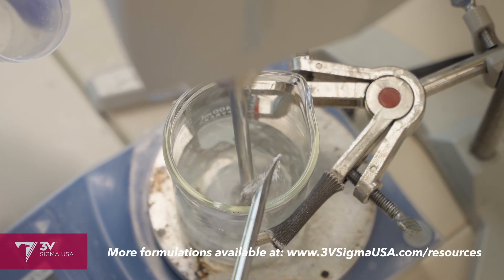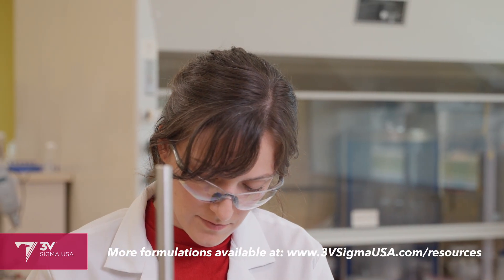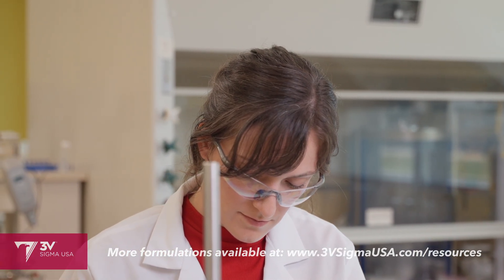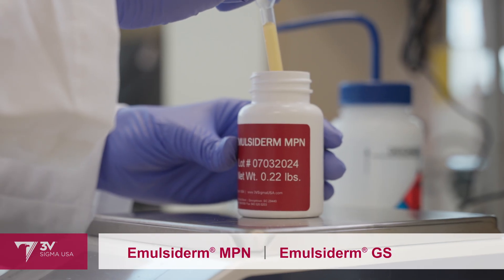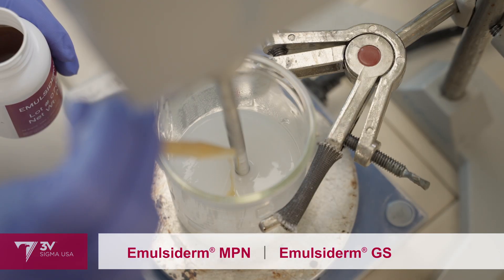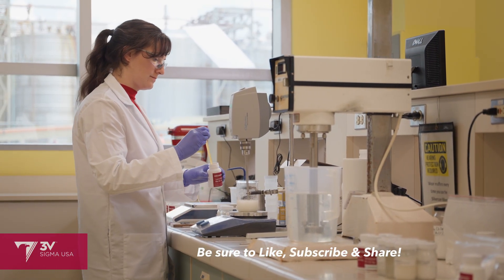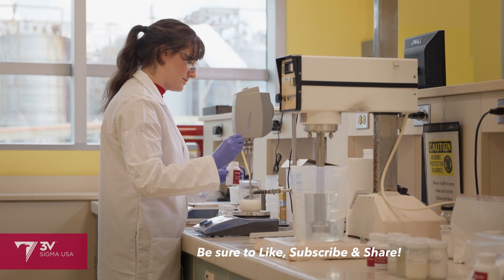Then I'm adding a bioengineered butylene glycol. This will be a single pot emulsion, so my next step is directly adding the emulsifiers. I'm using Emulsiderm MPN as the primary emulsifier and Emulsiderm GS as a co-emulsifier. These are both 100% naturally derived. And while I'm using heat to melt a few other materials in this formula, the Emulsiderm MPN itself is a versatile liquid emulsifier that supports room temperature processing in other applications.